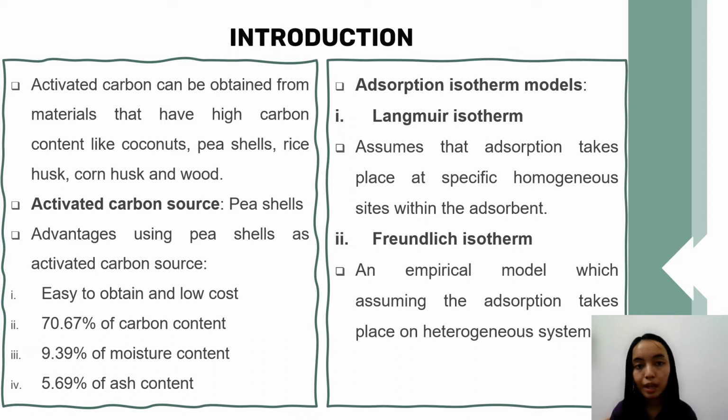It also has high carbon content, which is 70.67% of carbon. It also has low moisture and ash content, which is 9.39% and 5.69% respectively.